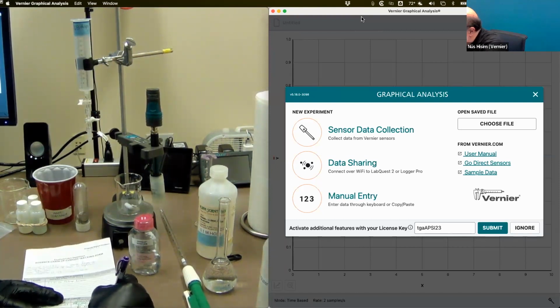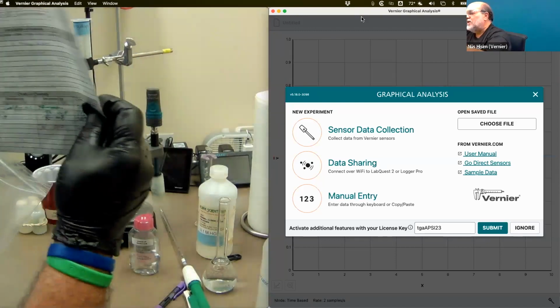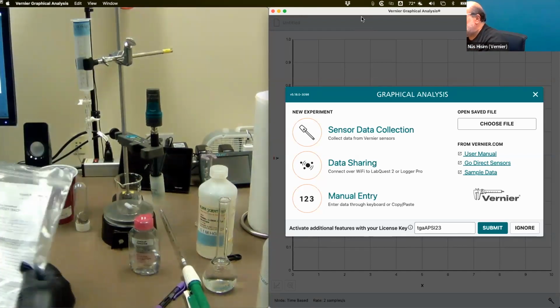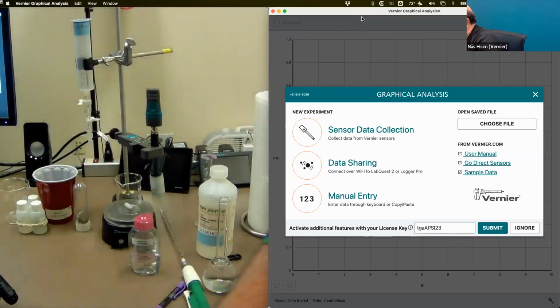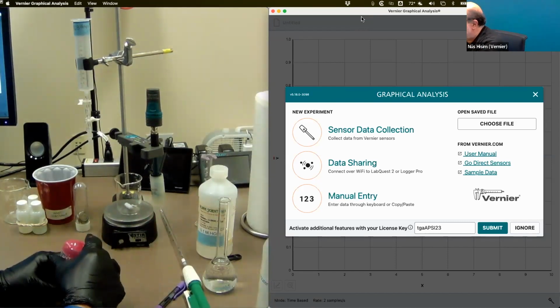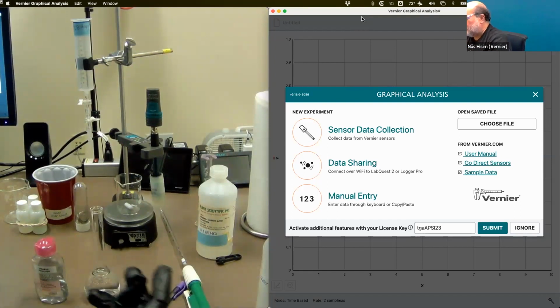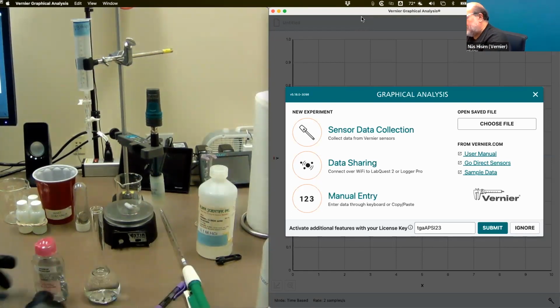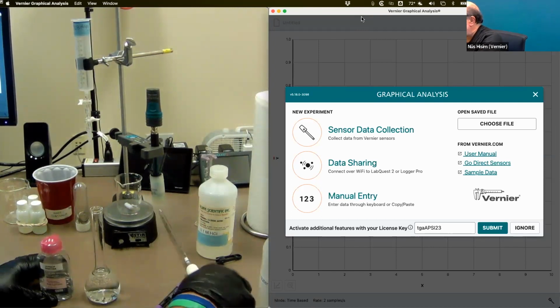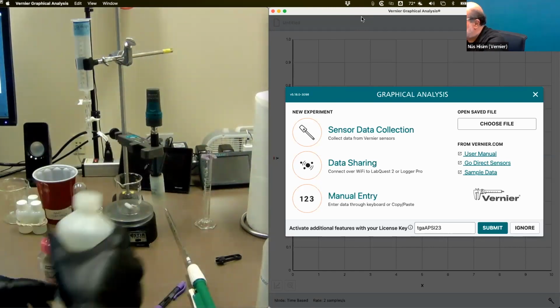I did have my students go through the whole process. It's a little hokey, but the kids didn't think that. At least they kind of got into it a little bit. So let me get that out of the way. Here is my makeup remover, and through the pre-lab, they have to dilute this and make 100 milliliters of solution. Determine that if this is 2 molar, how do I end up with a 0.1 molar solution, because that's going to be my known acid that I'm going to use.